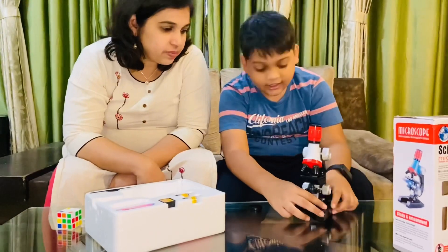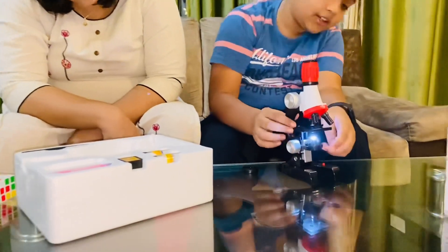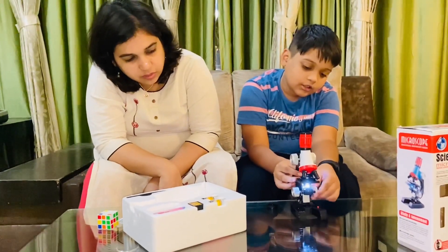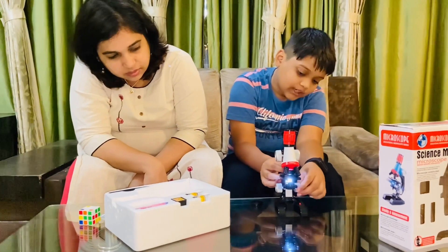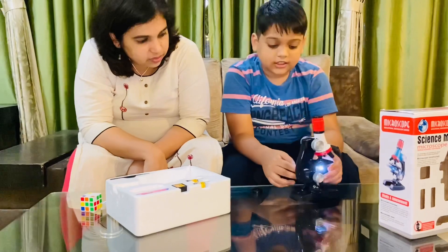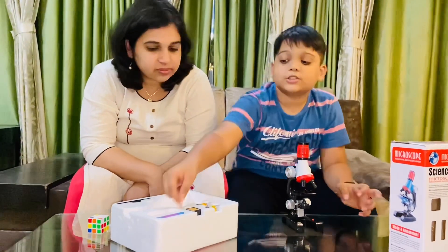The next part is the adjuster for the light. You can turn it on so everyone will be able to see. It needs batteries to operate. Once on, you can move the light closer or further away. Those are the main parts — let's move on to using the slide.